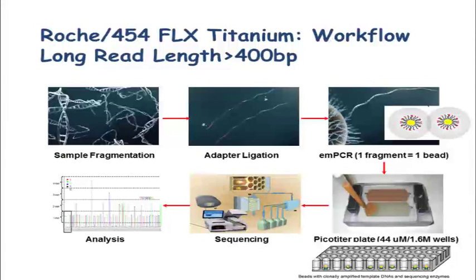The Roche 454 is one of the early platforms. Here is the workflow for this instrument.